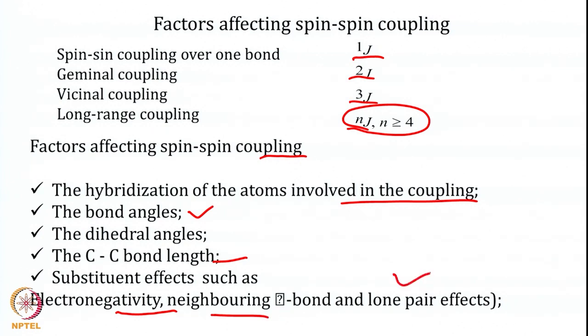In the next class we are going to discuss in detail how each of these parameters affects the coupling constant, and how using these concepts we can start interpreting some of the data.